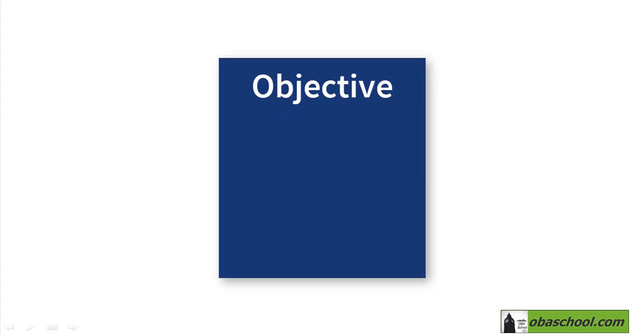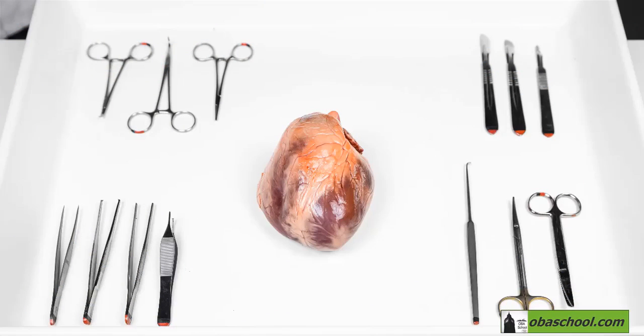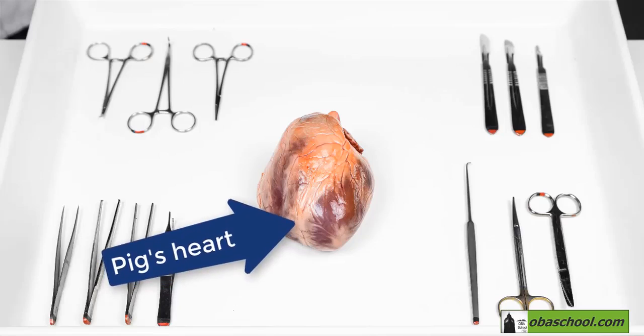In this tutorial, we're going to explain how to present the results after performing dissection. In the previous video, we've dissected a pig's heart. What can we do afterwards?